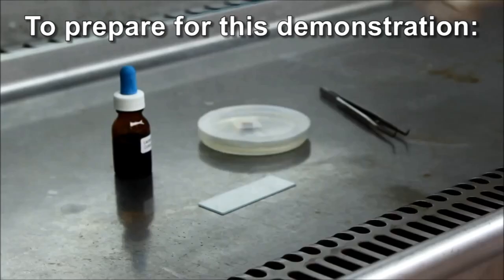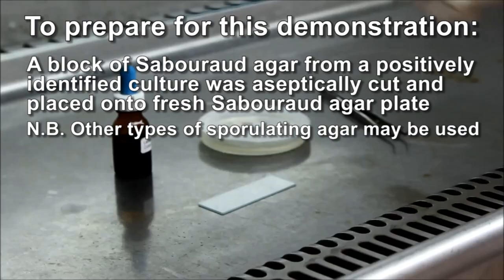To prepare for this demonstration, a block of Sabouraud agar from a previously positively identified culture was aseptically cut and placed onto a fresh Sabouraud agar plate to grow. A sterile coverslip was then placed aseptically onto the transferred block of fungus.